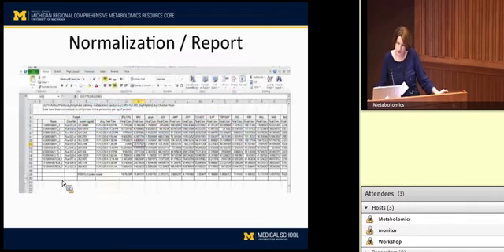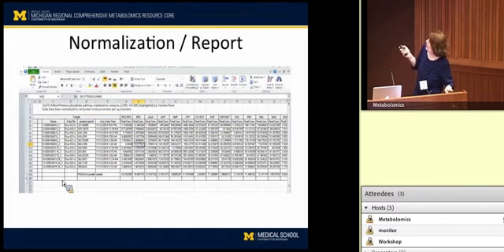All right. So coming back to the reporting, I can tell you that these samples are normalized. I want to say they are cell protein in this case. So they were normalized to the value, which is picomoles per microgram of protein. That is different for each type of analysis, and I'm not going to go into great detail about how we do it. It's just a concentration calculation.